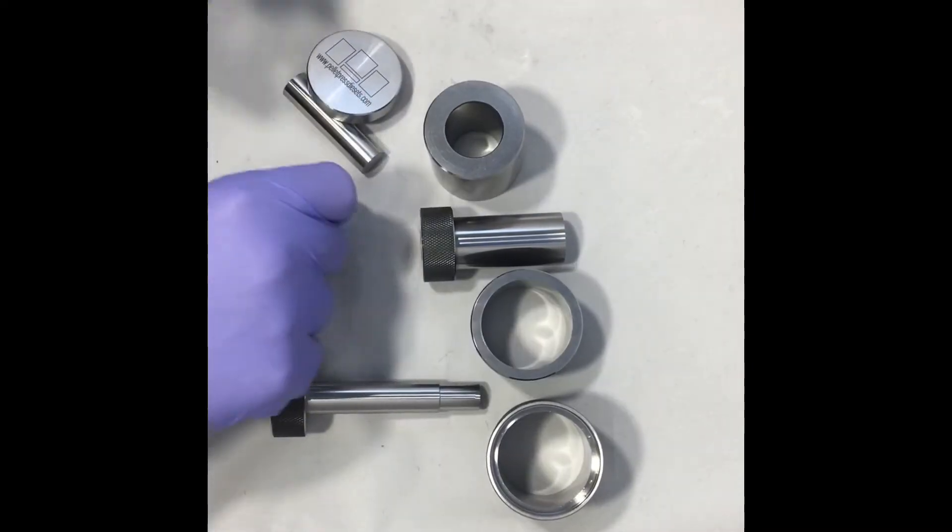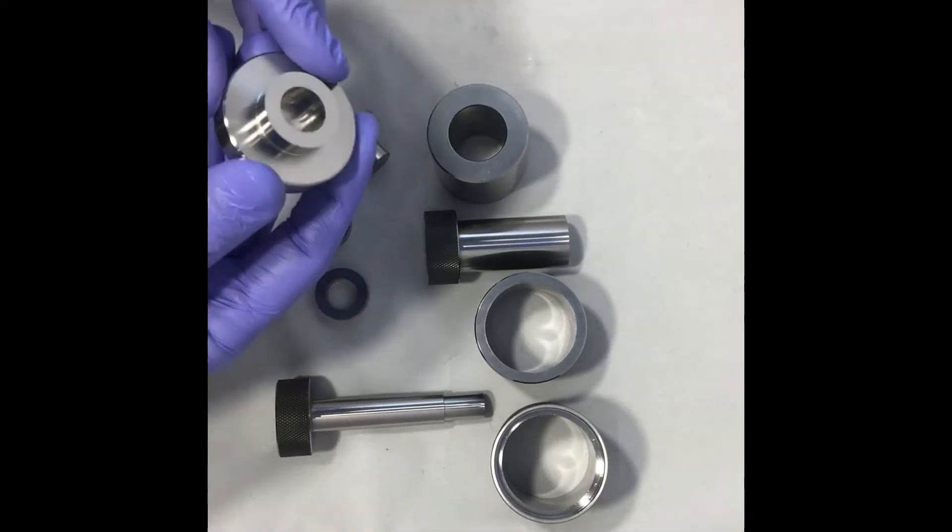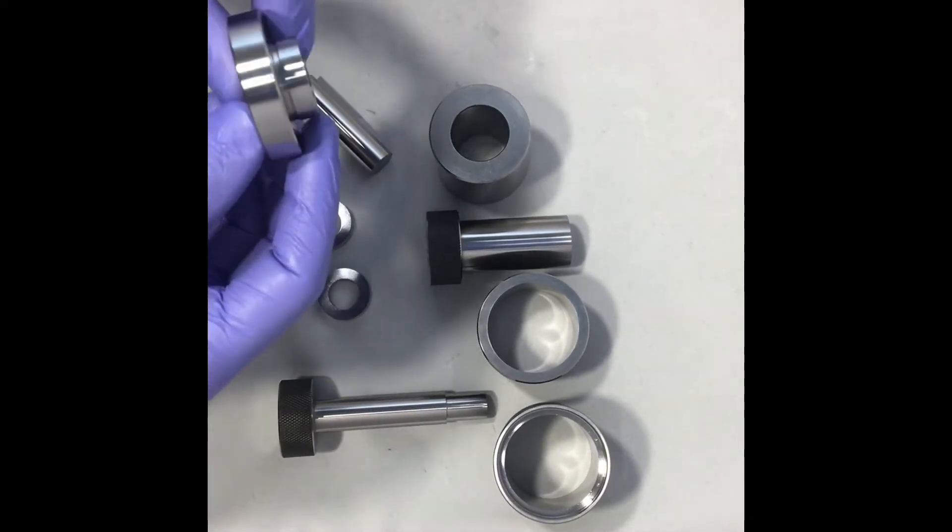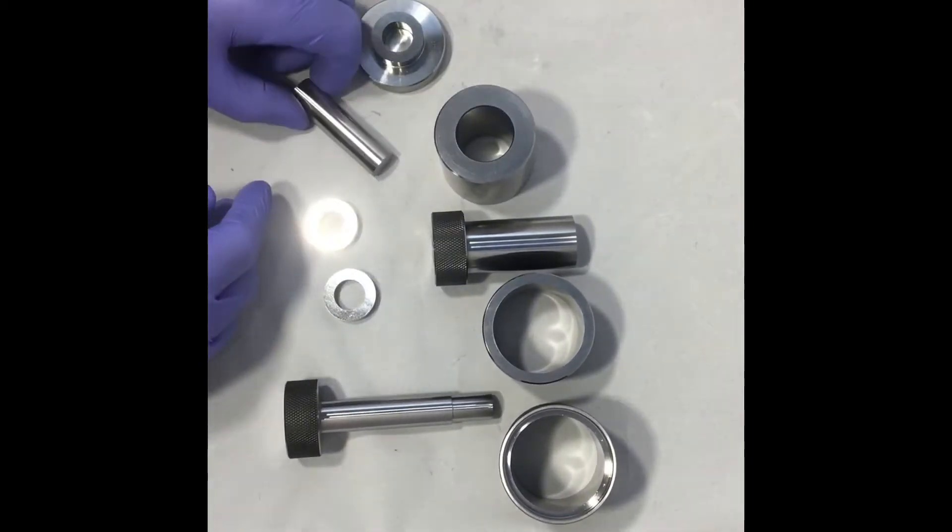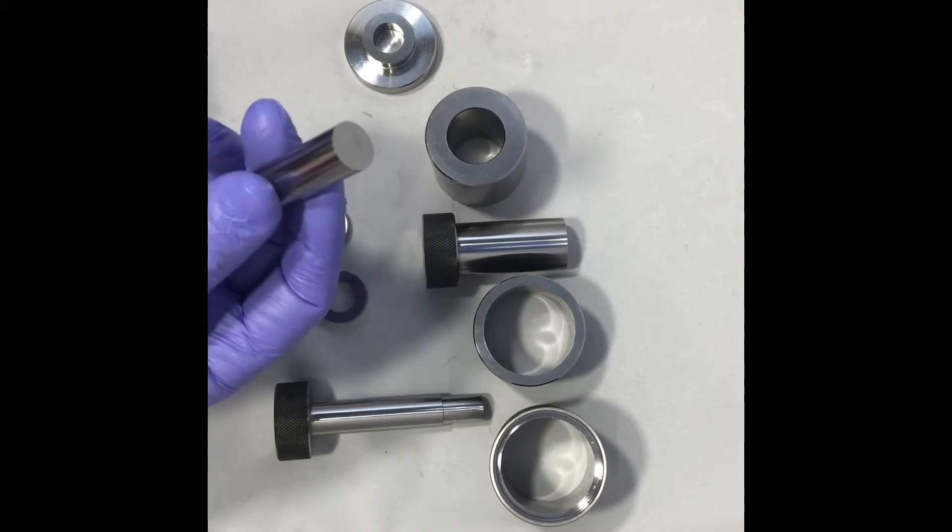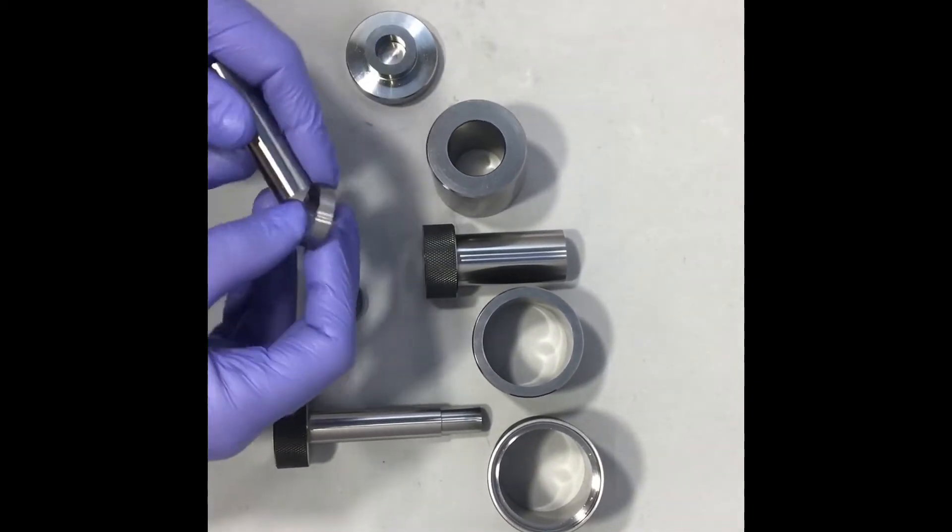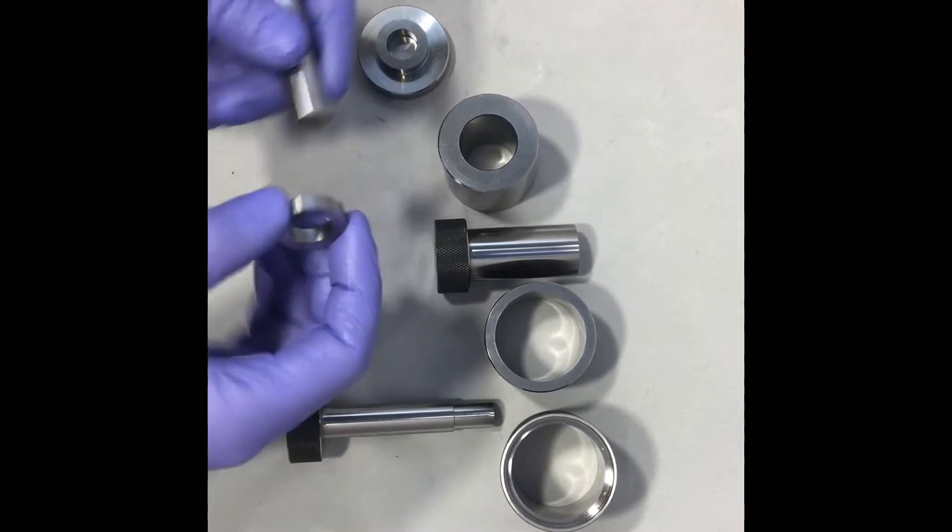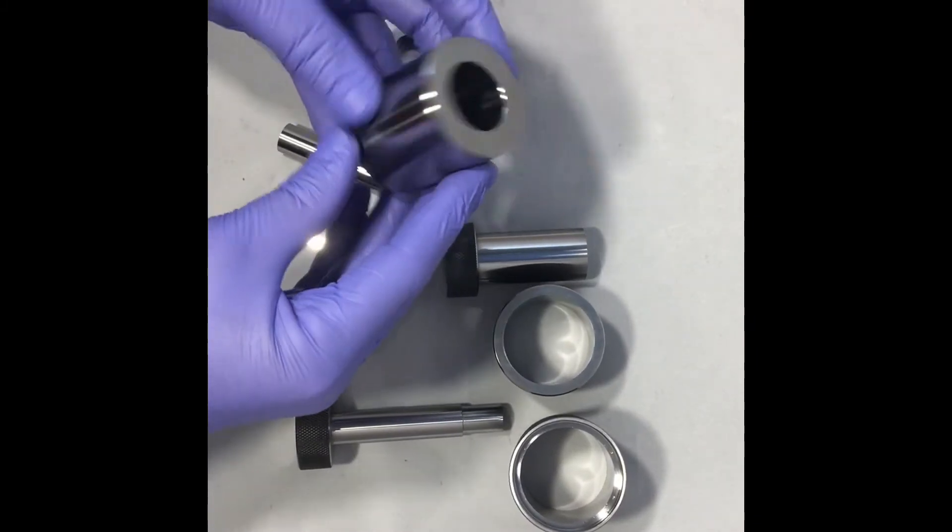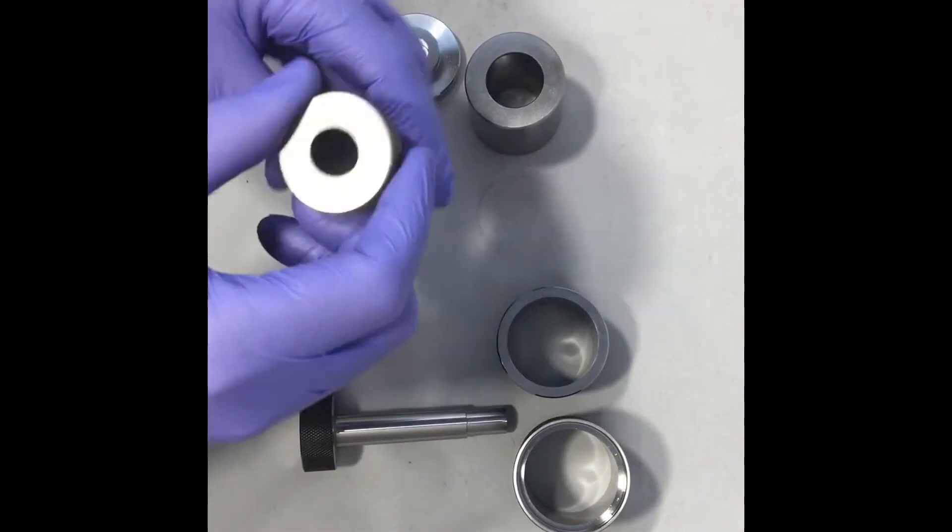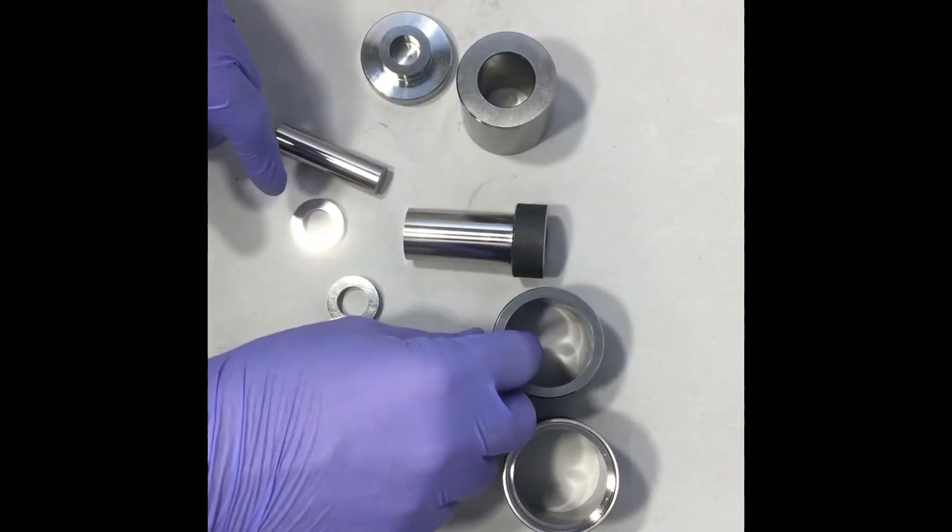This is one of the spacers from the set and this is how we do it. We have a base plate slightly modified with a hole in the middle part way through. We have a central pin that creates and stops the powder going through that central portion, a die sleeve just like our standard die sets, and a plunger with a hole down the middle which the pin goes into.